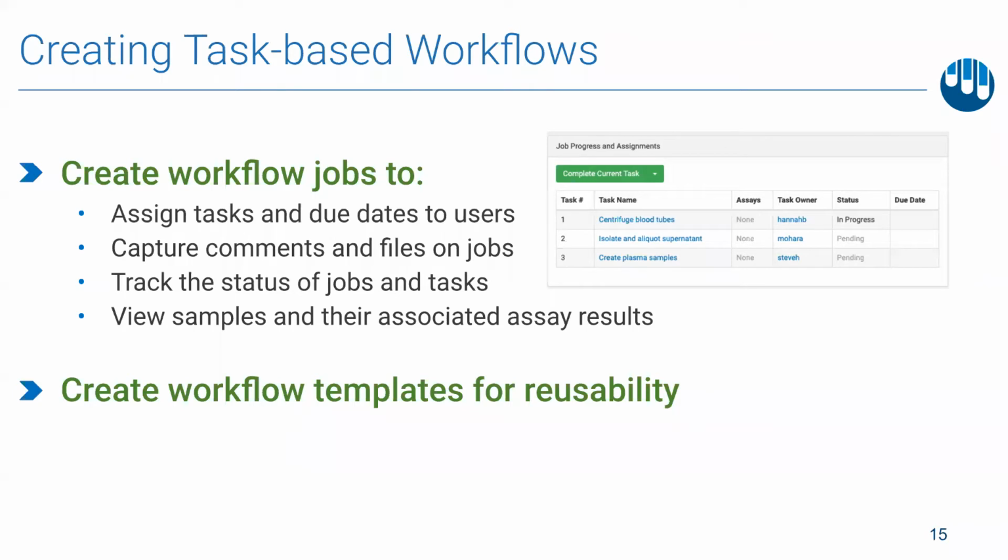Scientists can always create an ad hoc workflow job to capture a given workflow for that day, but for more standardized lab procedures, managers and other administrators can create workflow templates for teams to reuse.